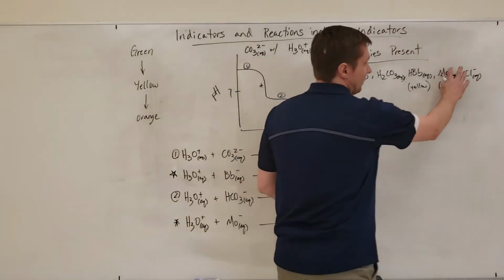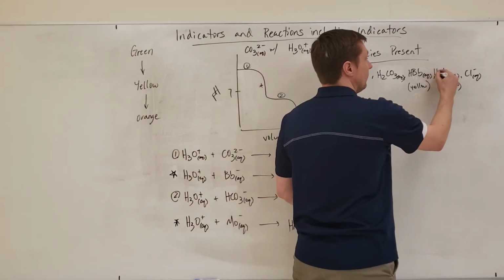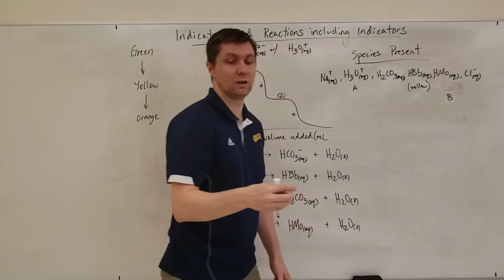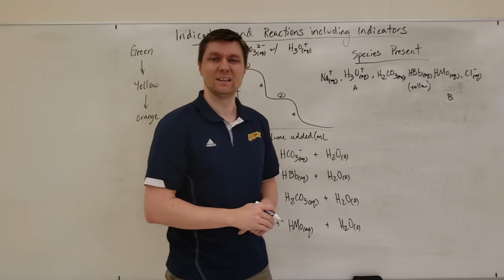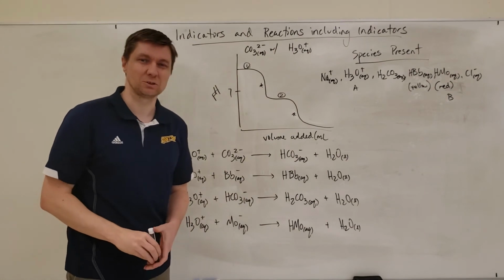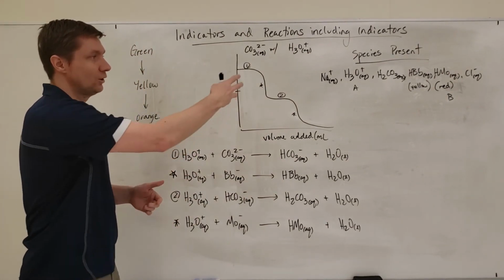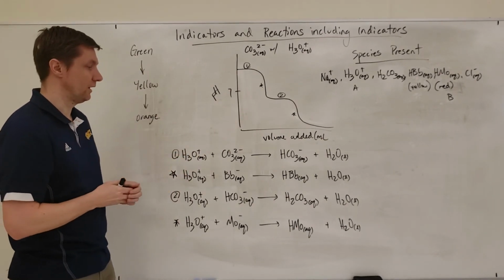And once all of the MO minus is reacted, making HMO, I'm going to have that molecule instead. And if you look in your acid-base indicator chart, you'll see that HMO is a red color. Now this methyl orange that we have is a bit of a pinkish red, so that's why we got this sort of pinkish orange color, but yellow plus red gives us orange, and so that's what we're illustrating here with this demonstration.